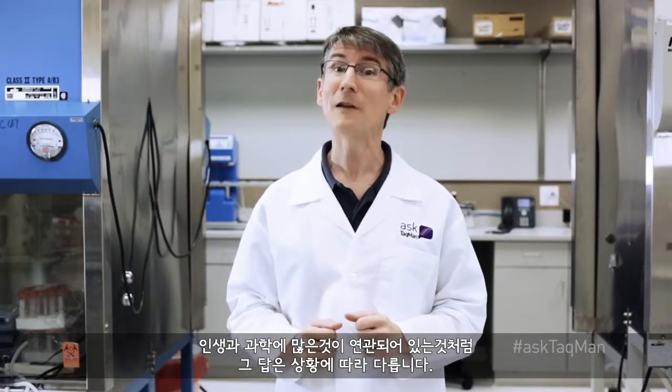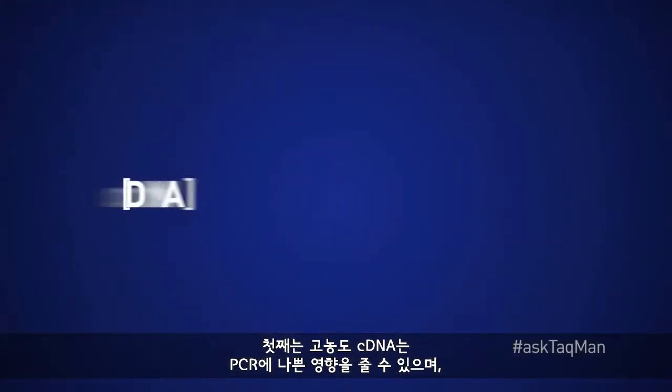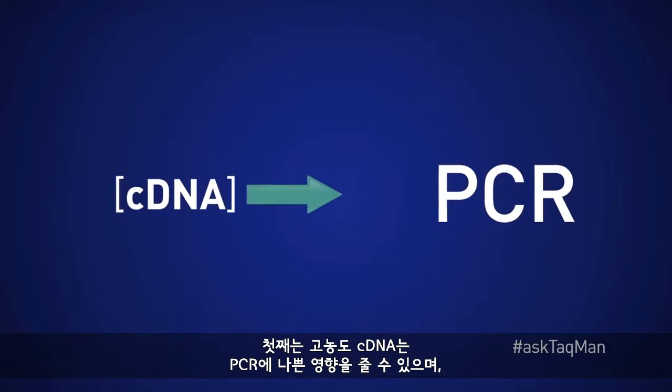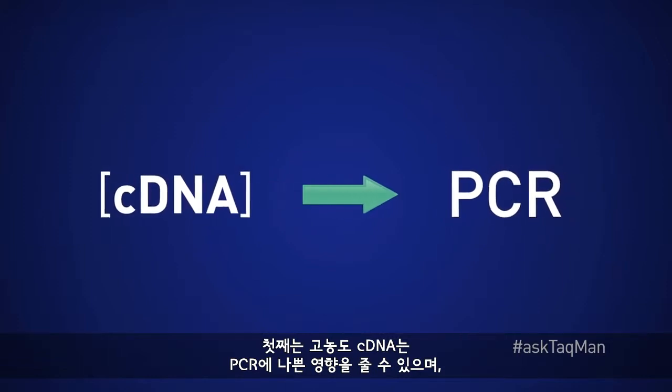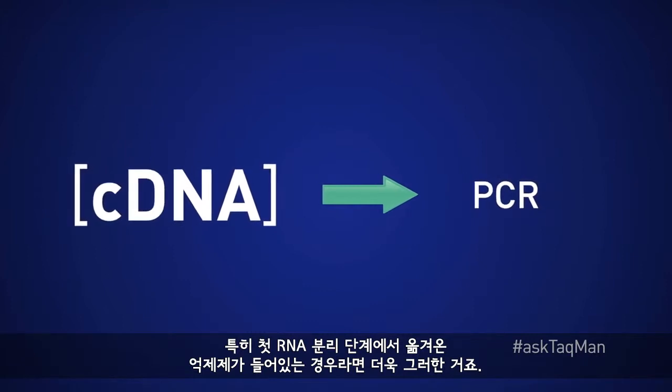So who's right? Well, like so many things in both life and the lab, it depends. To see what I mean, let's talk about the most common reasons that some people choose to dilute cDNA. First concern: high-concentration cDNA might have a negative effect on PCR, especially if it contains inhibitors carried over from the initial RNA isolation step.